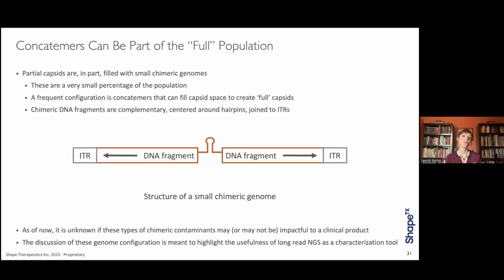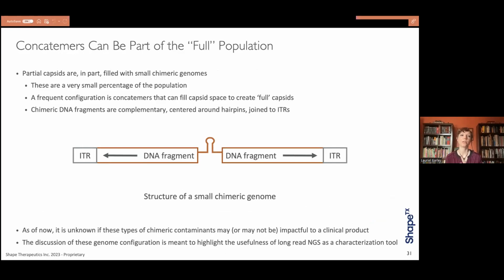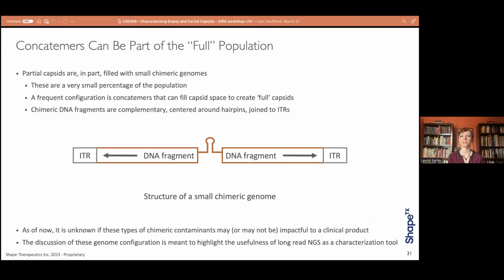So next, I'm going to move on to these concatemers, and I'm going to caution this a lot in that these are a very small percentage of the population. They tend to have the same configuration, and we really don't know if these types of contaminants are impactful on a clinical product. And that, again, might depend on the setting or the disease or the patient itself or the dose.